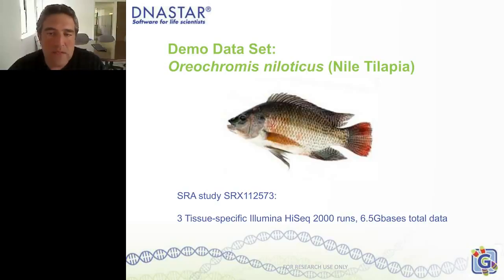And the organism does not have a sequenced genome that's well annotated, right? So it has a limited amount of annotated transcripts. So it's a typical kind of organism someone might want to do a de novo transcriptome assembly with.